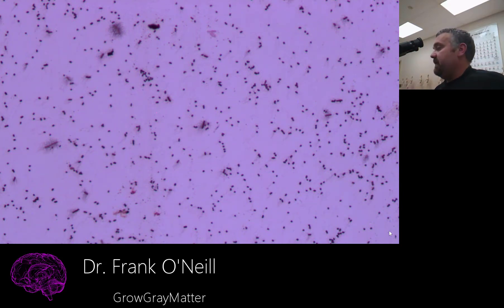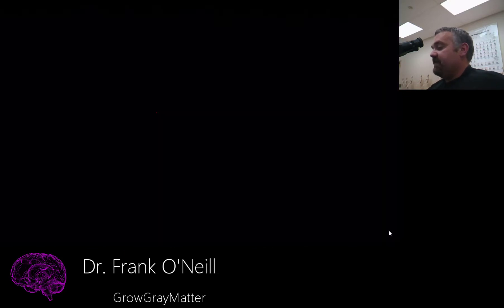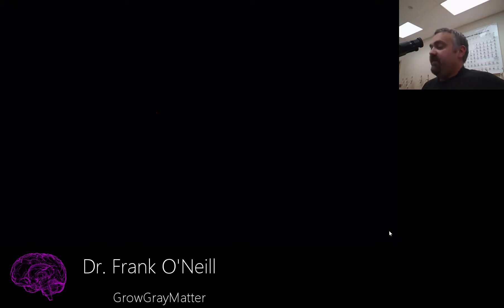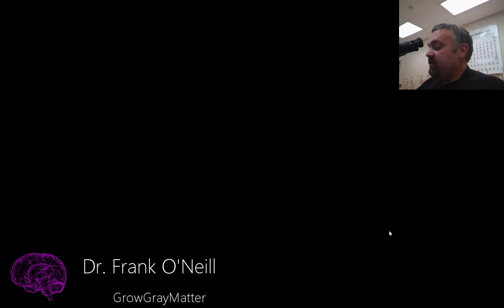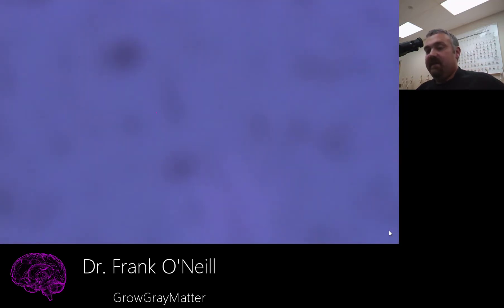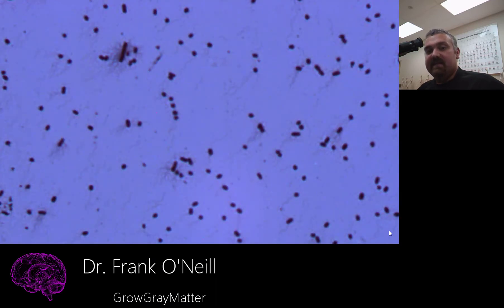When using oil immersion, here's how you do it: I'm going to turn the objective halfway so it looks black, then put a single drop of immersion oil on the center of the slide — in other videos I'll explain why immersion oil works and why we need it. Then I'm going to slowly move the oil immersion 100x objective into place. I have to tweak the light quite a bit here, so bear with me as I make an image you can see. And voilà.